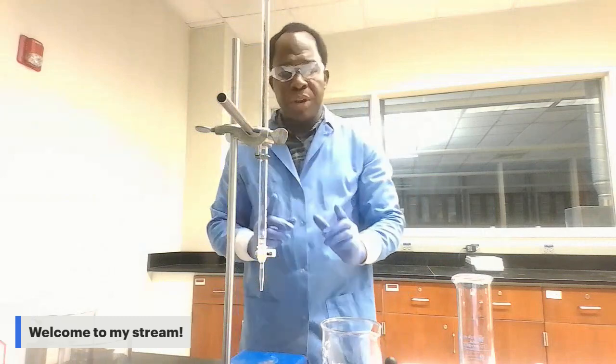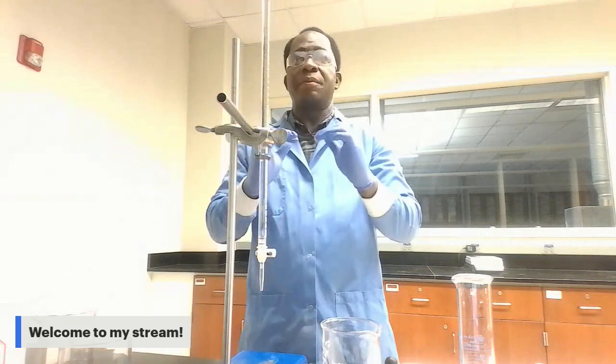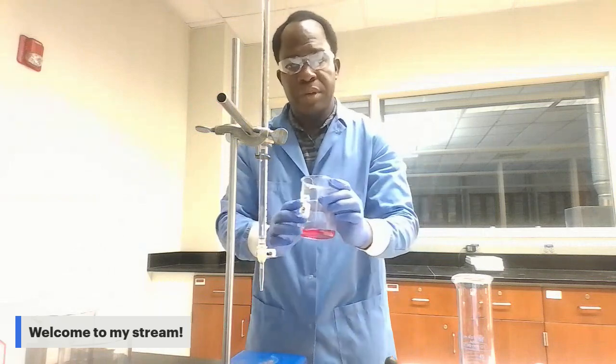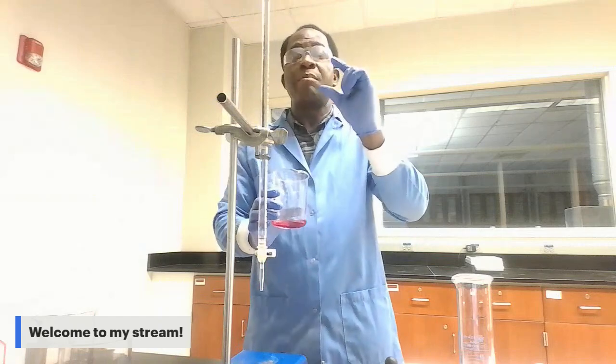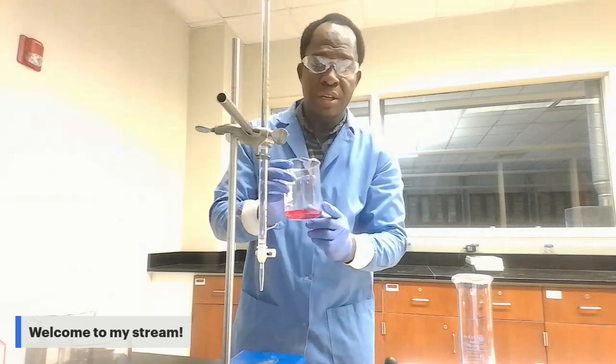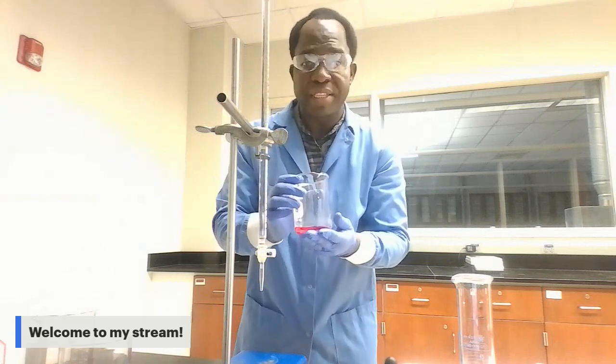And what will happen is that after adding the HCl to the solution by increments of 1 milliliter, the color of this solution will change to clear when you get to the equivalence.